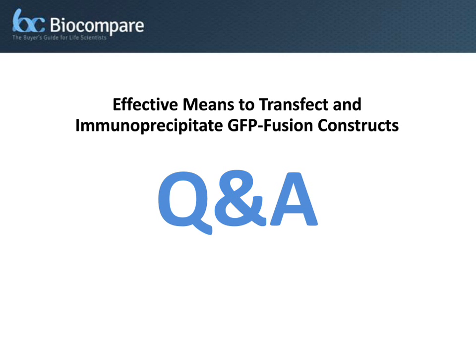Right. Okay. Thanks. Nandan, a question for you. How long after electroporation is there significant signal or protein activity, and how long does it last? Right. So this depends to some extent on the type of enhancer and promoter that's used, as well as the cell type.